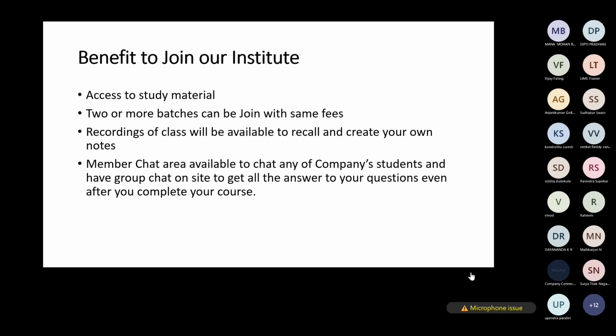Hello, yes, sir. Now we are discussing LabWare LIMS. Not every company needs to buy and implement LabWare; some will implement Caliber also. So how can we implement Caliber?